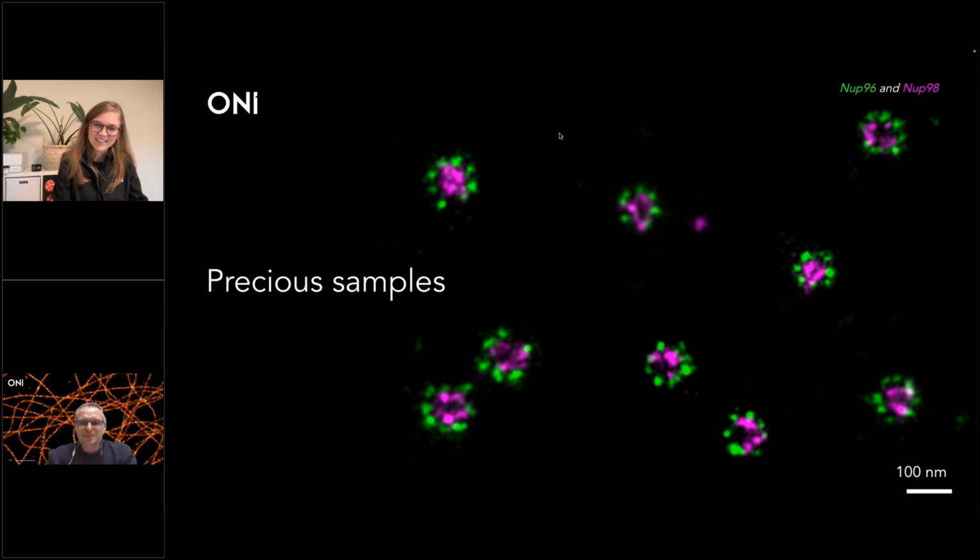Me neither, I've never seen this. Were they live cells or fixed cells? Yeah, they were live when we isolated them, and then we fixed them. But even if you look at a bright field image just in tissue culture, you already started to see that they were really black. Very interesting. Wow. Okay, so another thing to watch out for, the cell autofluorescence. Do not underestimate the effect and do not burst your cells, please.